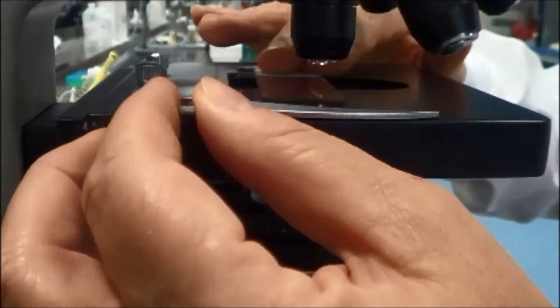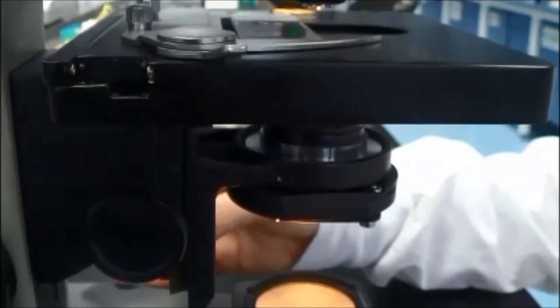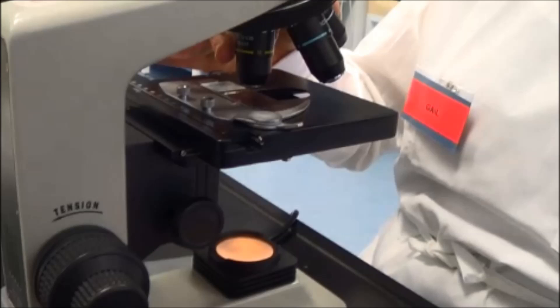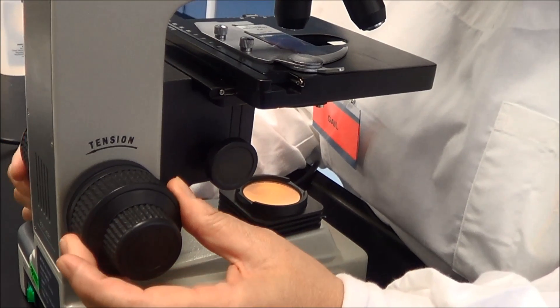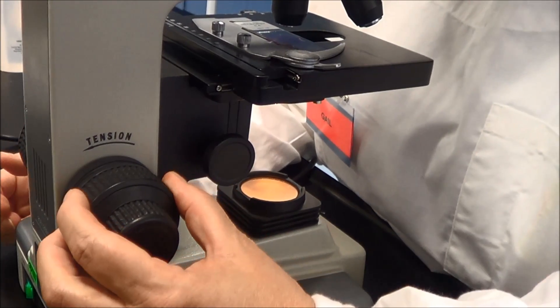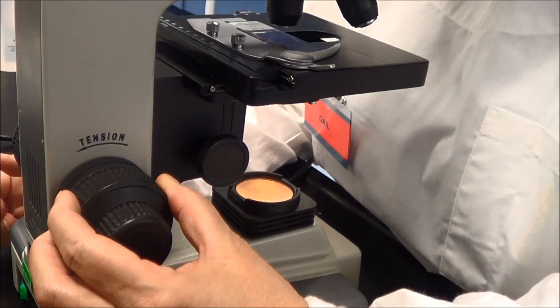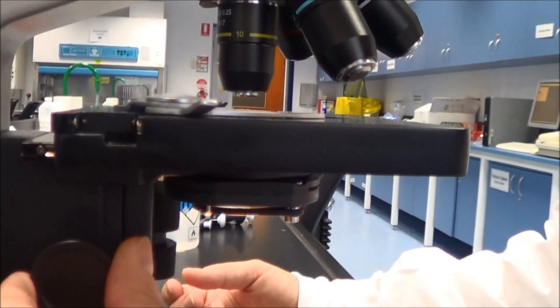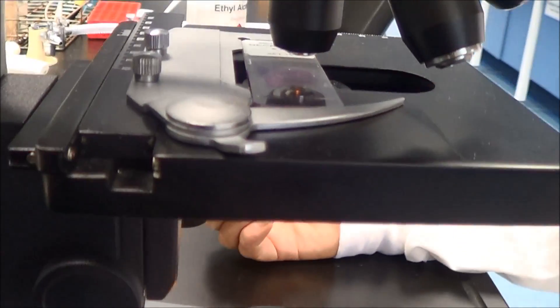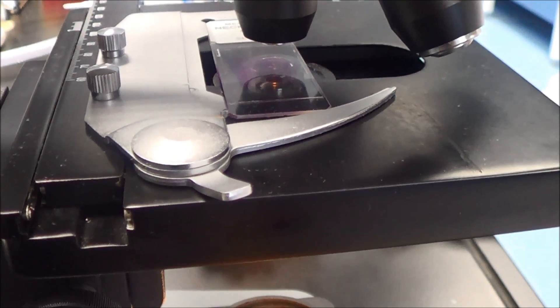Load the slide onto the stage holding it in place with the stage clip. Turn the nosepiece until the 10x objective is directly above the stage. Bring the stage up to a maximum height by winding the coarse focusing control clockwise until it reaches a stop. Use the condenser adjustment knob on the left hand side of the microscope to move the condenser to the uppermost position.